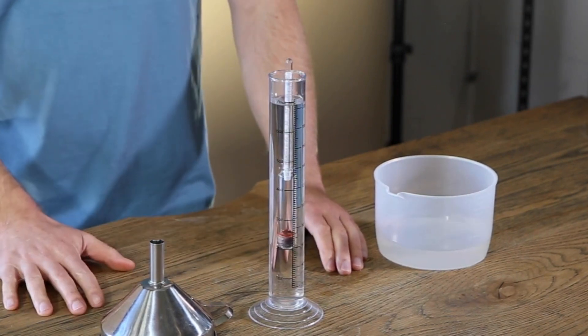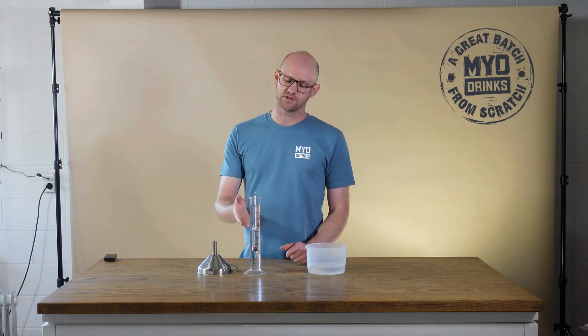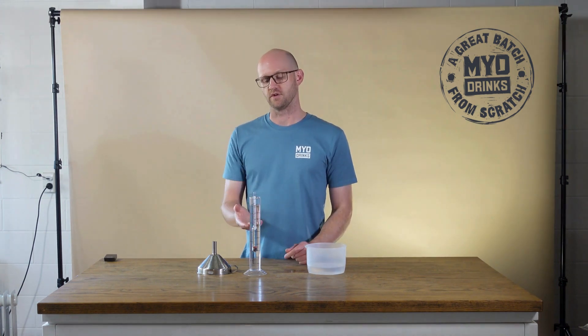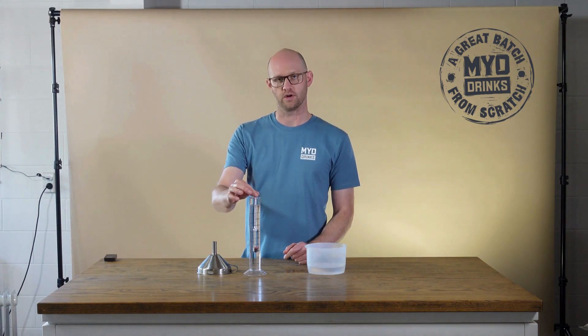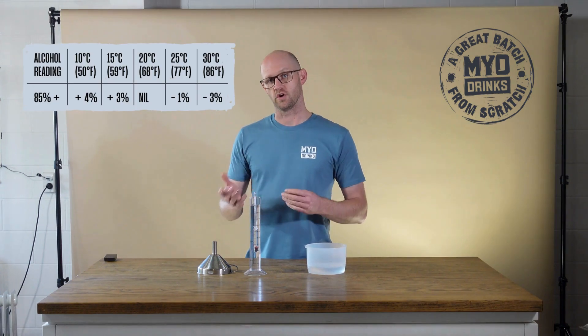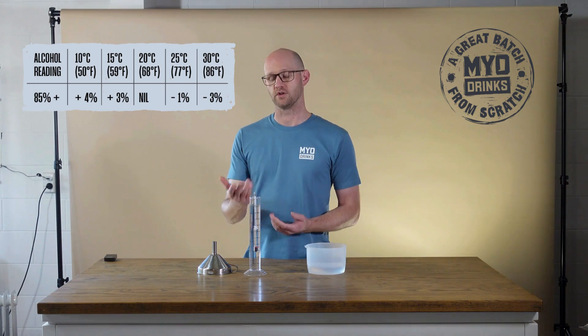This alcometer is calibrated to 20 degrees Celsius, so if your spirit is hotter or cooler than 20 degrees, it's going to give you an inaccurate reading. There is a calibration sheet that'll give you a guide as to what the adjusted ABV is, depending on the temperature of your liquid.